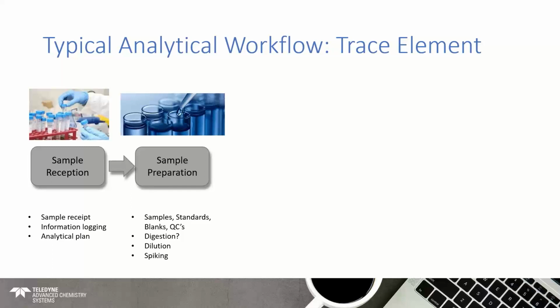There might be numerous steps involved in this. So for your samples, there might be digestion required, there might be filtering, you might need, well, you will need to dilute them to one extent or another. There might be spiking of certain reagents or an internal standard. So there's a lot that goes on in this area in sample preparation. Sample preparation is one of those areas that's typically underestimated in the amount of time and effort that goes into it.